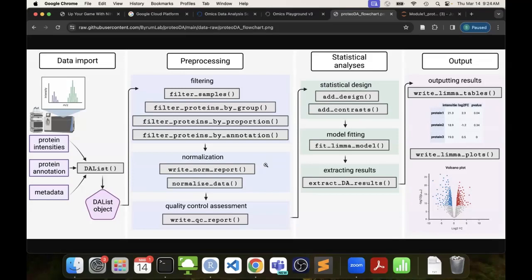Then the normalization is going to run my ProteoNorm app that we developed about three years ago now. ProteoNorm took some of the functions that are in the NormalyzerDE package. There are eight different normalization methods that are commonly used for proteomics data. We run all eight of those methods and build a report.